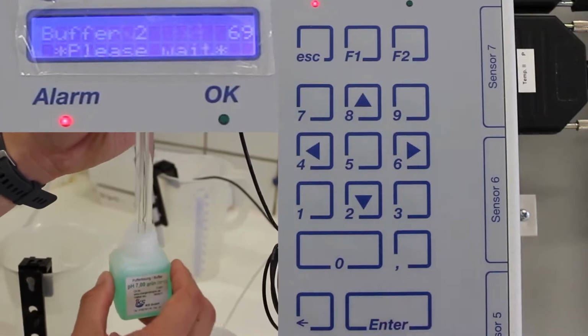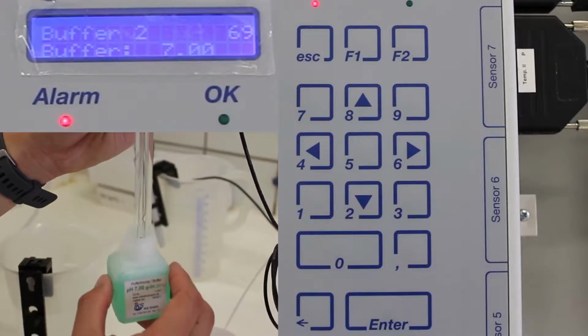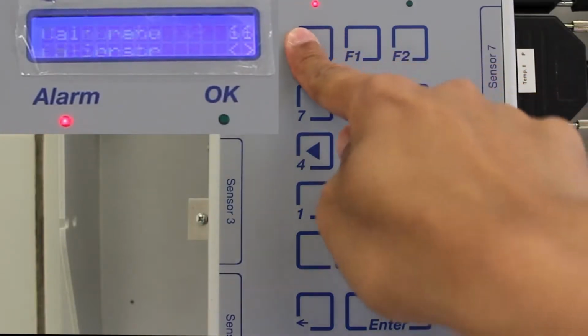Press Enter key again and wait until the value 7 appears in the display. Confirm calibration by pressing Enter. Go back to the main menu by pressing Escape.